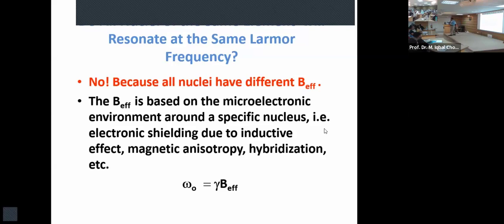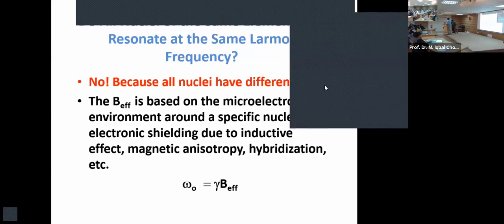I think you're probably dissolving fat into some other solvent, and you are recording the proton NMR of liquid phase, soluble fat. Solid state NMRs are really very specialized and they cost a lot. We have been trying to have one, but we don't have it yet.